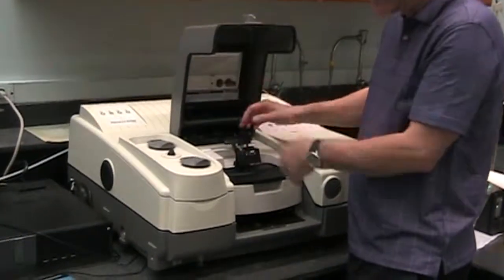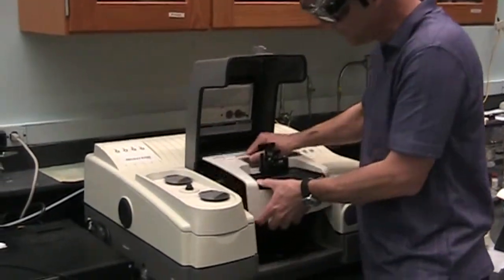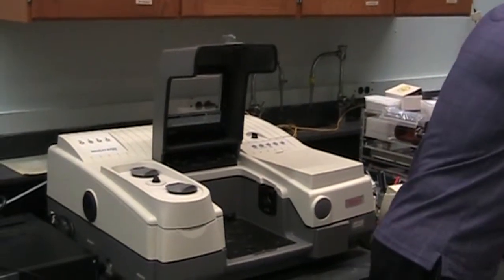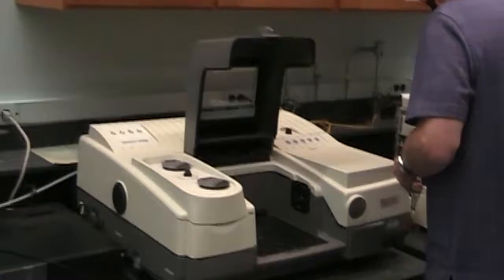So when you're done using the ATR, we're just going to reverse this process. So just simply pull this straight out. Goes in a box. And I'm going to get ready to run some other types of samples. So I'm going to put the sample holder back in place.